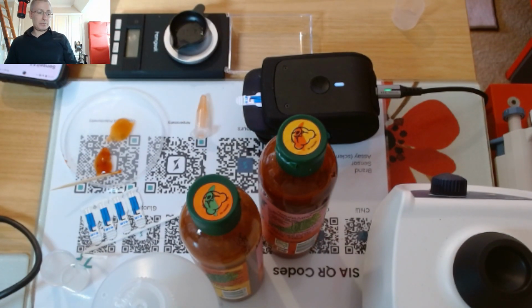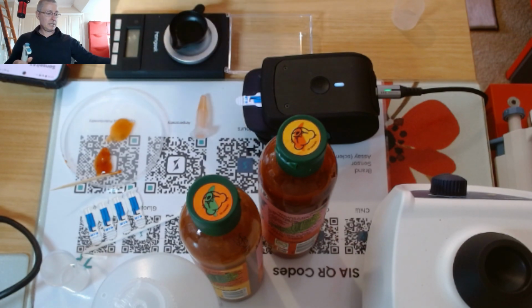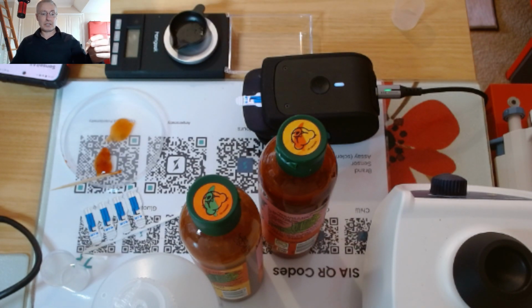I realise I actually need a pipette tip, so I'm just going to have a quick look. Yeah, I've got some pipette tips here. So I'm going to put a sample onto the sensor almost now. Let me load that pipette tip onto the pipette. I'm going to take this sample and show it to you quickly.